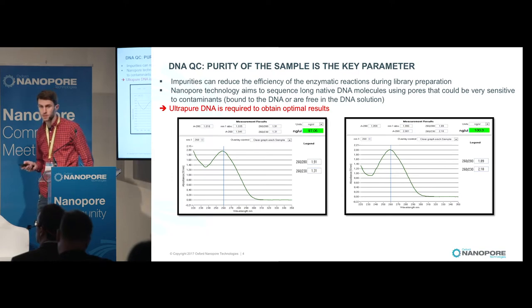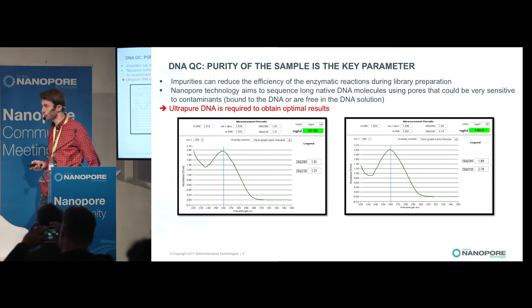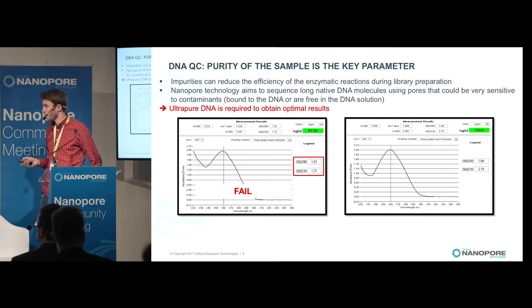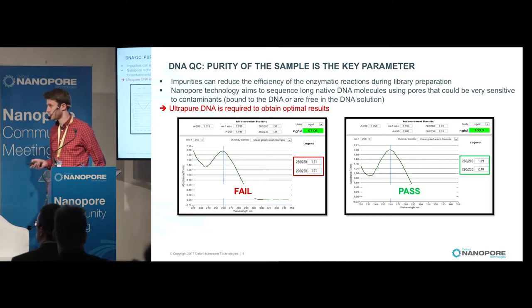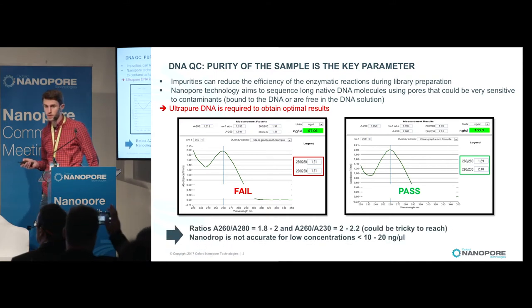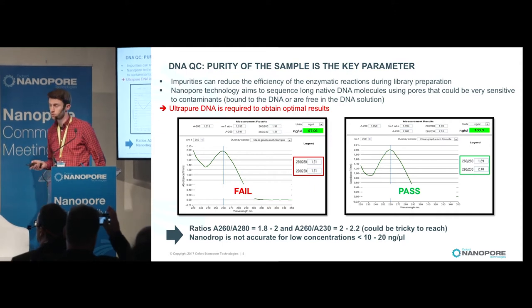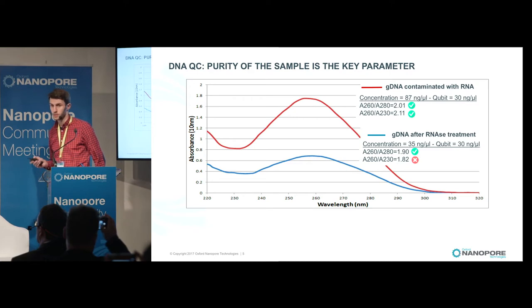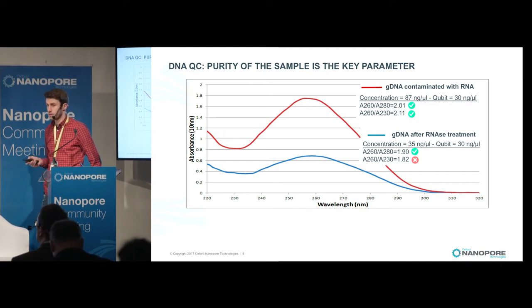The best way to assess the purity of DNA is to use a Nanodrop. Here you have two samples analyzed with the Nanodrop. The first one is a very dirty DNA with a contaminant that absorbs at 230 nanometers, and the second one is a very clean DNA suitable for Nanopore sequencing. It's very important to have good ratios, but keep in mind that the Nanodrop is not very accurate at low concentrations, and some contaminants absorb at 260 nanometers, which can artificially increase the ratios.